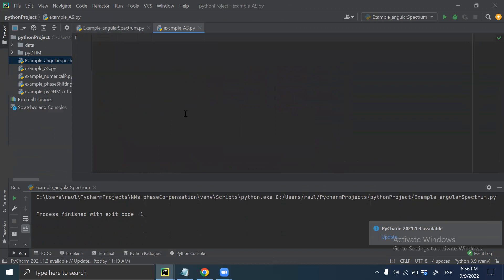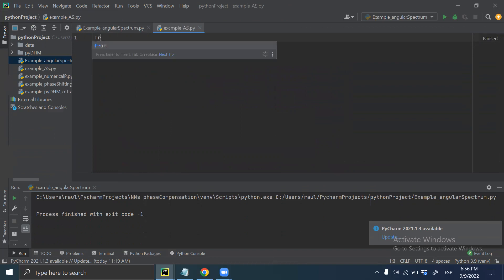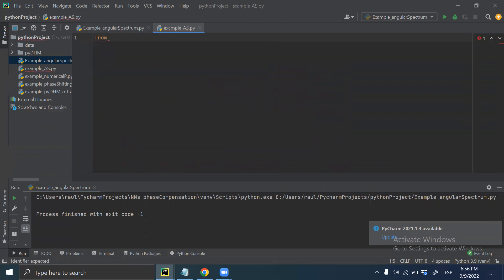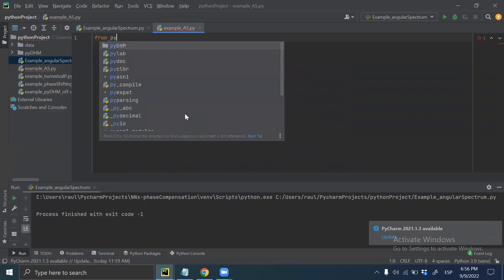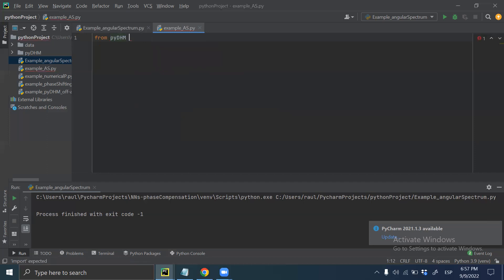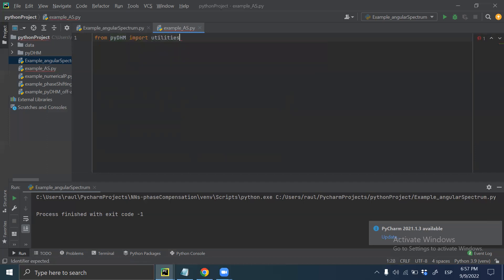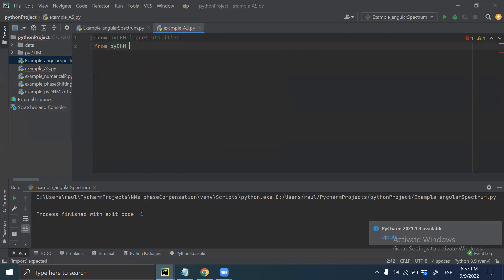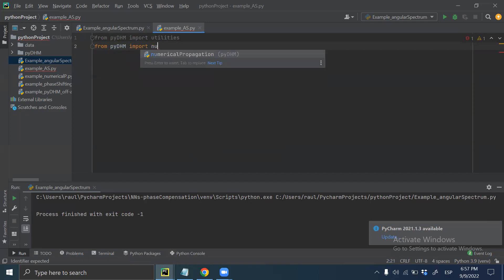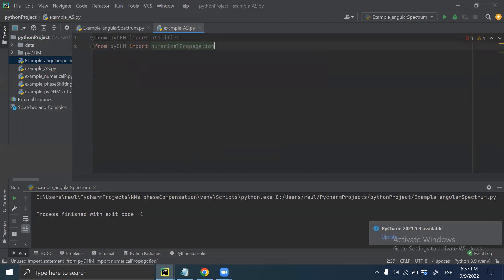After creating the Python file, the first step is to call the library. From PyDHM, we need to import a utility package, and also from PyDHM, we need to import the numerical propagation package.